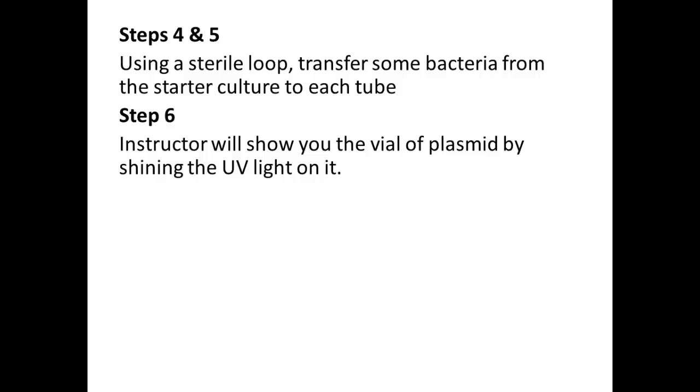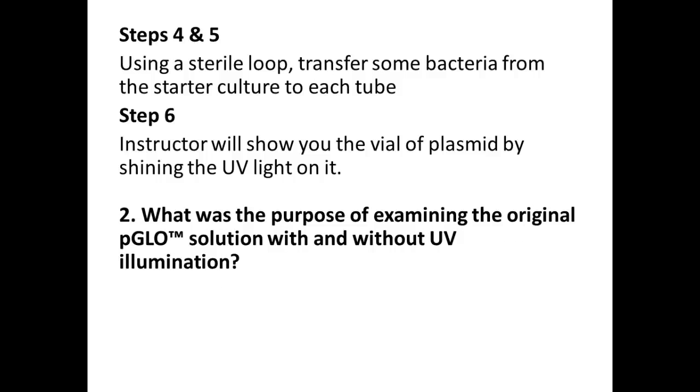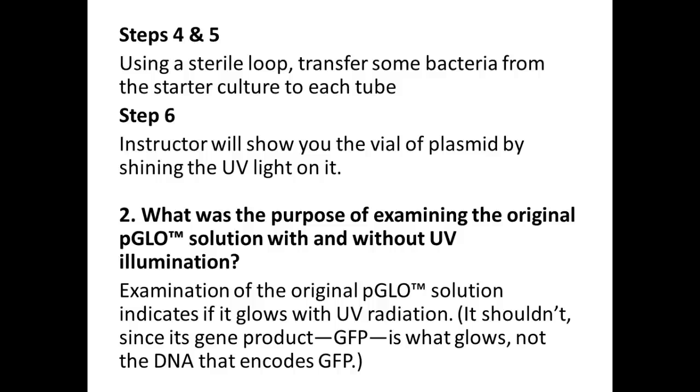Should it fluoresce under the UV light? DNA? No. The protein fluoresces, right? Not the DNA. So as long as there's no protein contamination of my sample, should you see any glowing? No, right? So this isn't a David Copperfield or Chris Angel magic trick. This is real science today. Okay? So only the product, only the protein glows, not the DNA that codes for the information to do that.